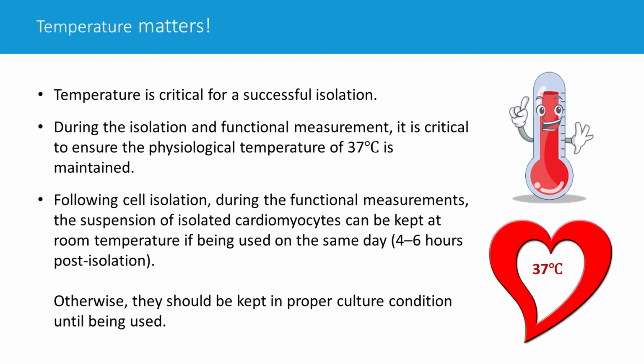To be all honest, only when the system broke down, the temperature circulating system broke down. In those conditions, generally we did not get good cells out of it. But that's anecdotal. If we are not in those failure situations and just control the system temperature to drop lower, I actually could not answer that.